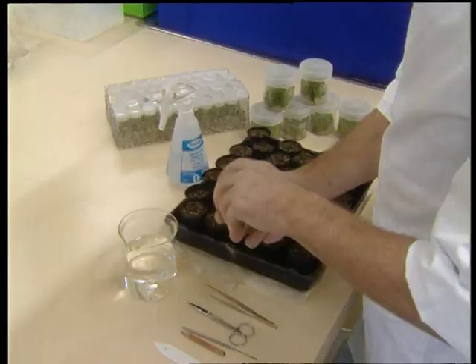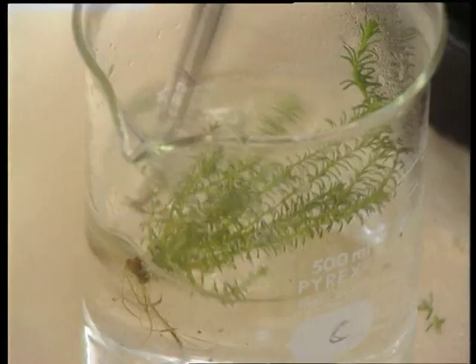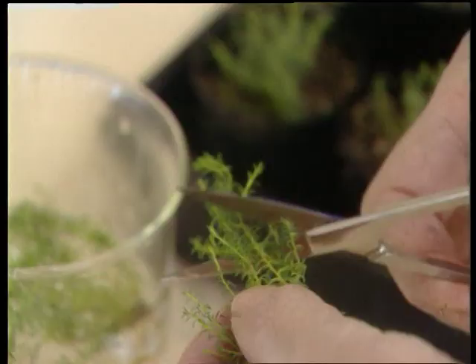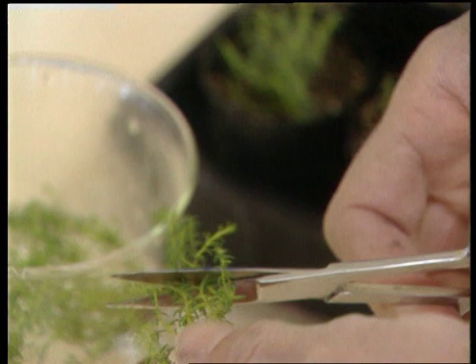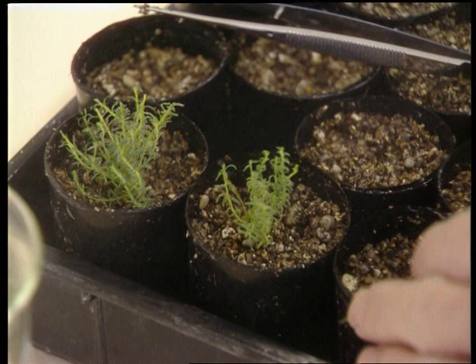Because of these reasons, the in vitro grown plantlets need to be introduced to the outside environment in a gradual manner. As a general rule, the plantlets are removed from the culture vessel in a room away from direct sunlight. The gelling agent is washed away completely to remove a potential source of contamination. The long roots and shoots are slightly trimmed and the plants are then transferred into a suitable pasteurized potting mix. The potting mix may be a mixture of sand, peat, and vermiculite.